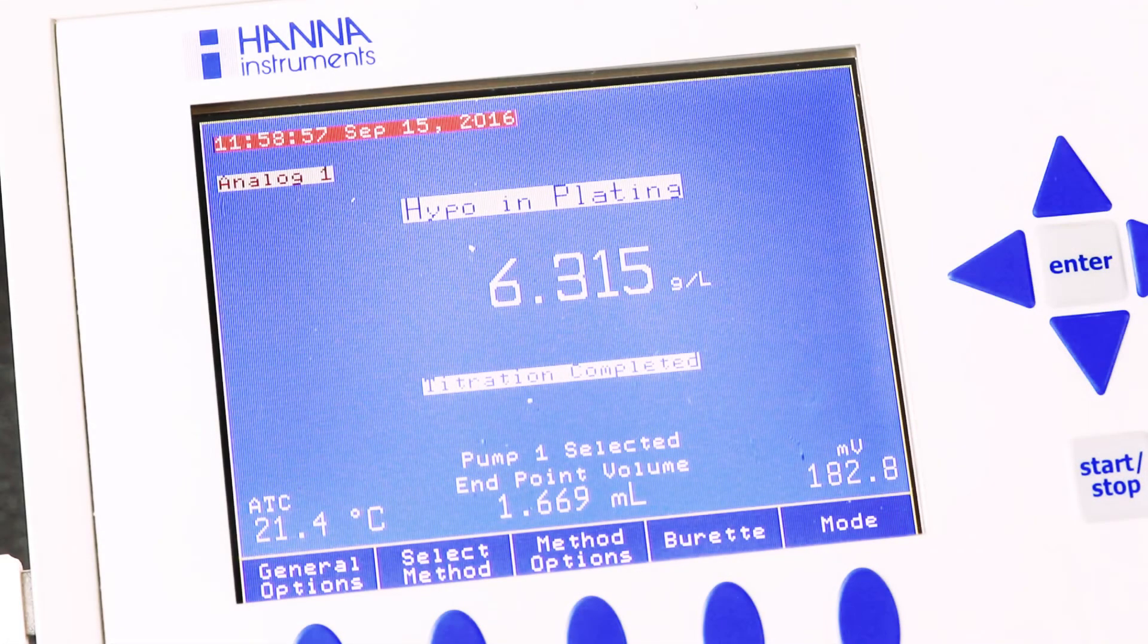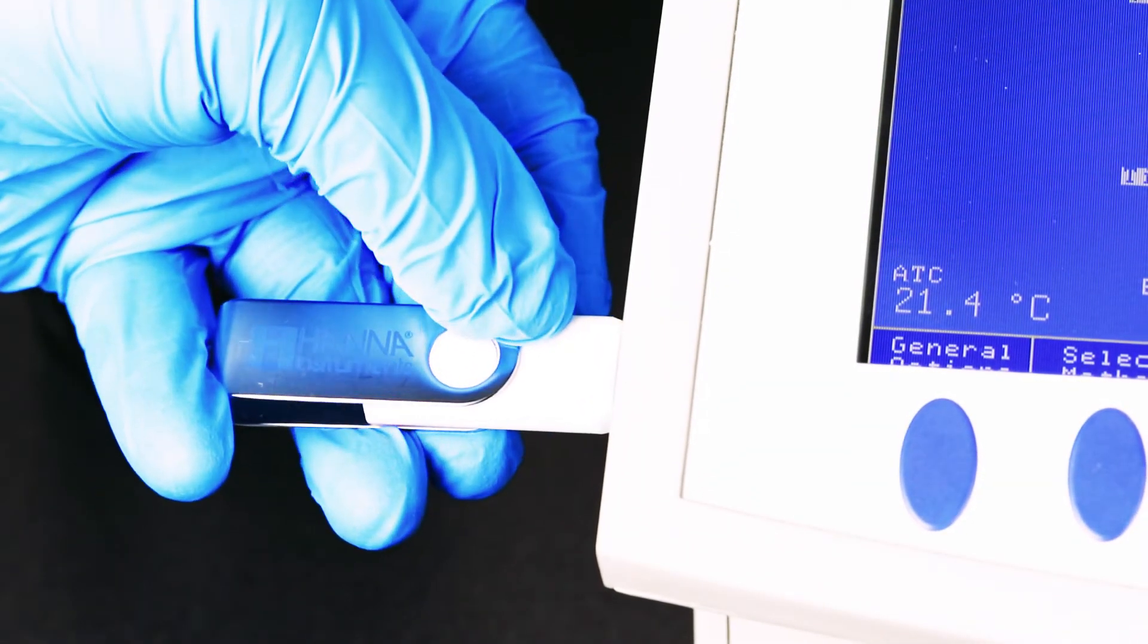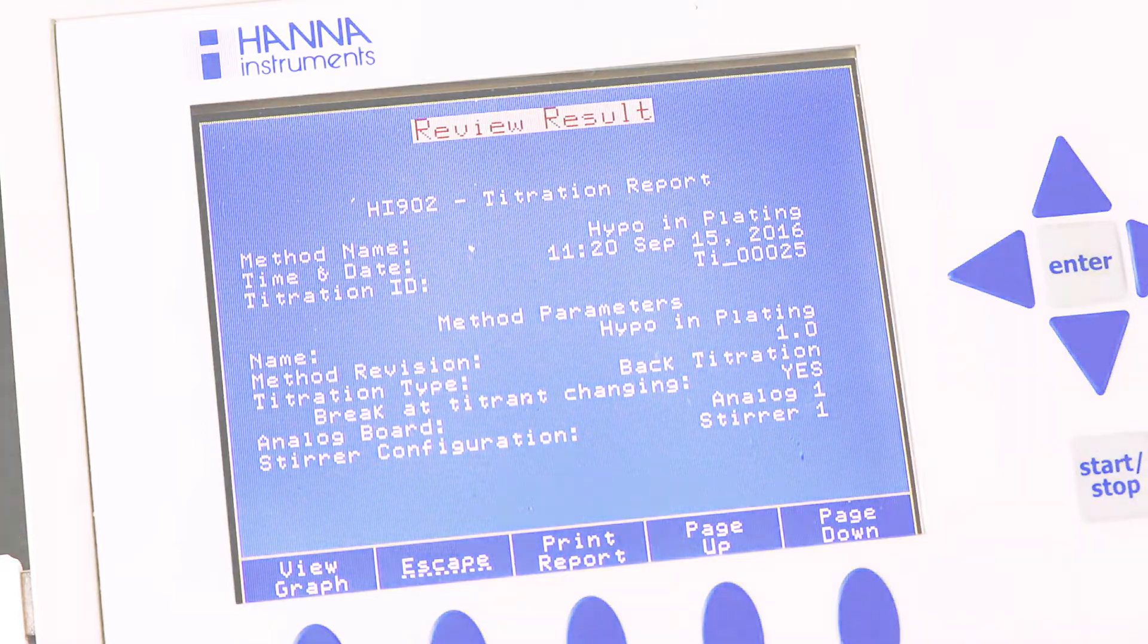Once complete, any reports can be exported via USB drive, PC, or printed directly using a parallel printer.